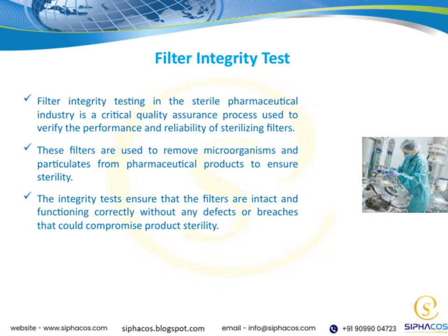Think of it this way. If a filter isn't functioning properly, it could let contaminants slip through, putting the safety of the final product at risk. That's why integrity testing is so important. It helps us confirm that the filters are intact and working as they should, without any defects or breaches that could compromise sterility. In essence, filter integrity testing is our safeguard to make sure every sterile product leaving the facility is truly safe and contaminant-free. It's a key part of maintaining trust and compliance in our industry.